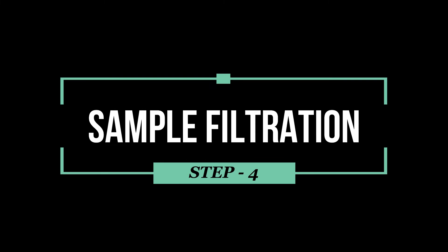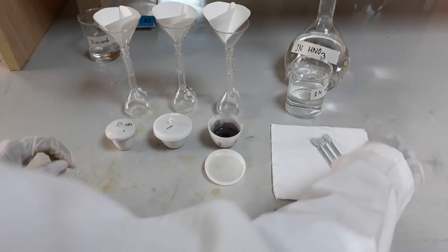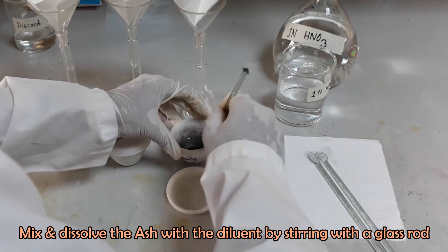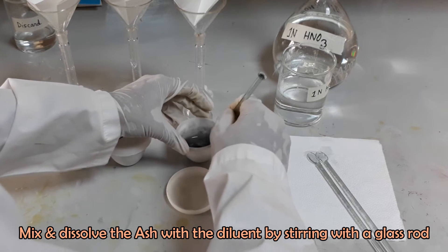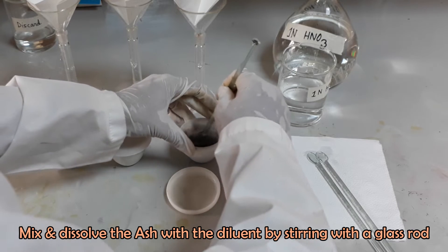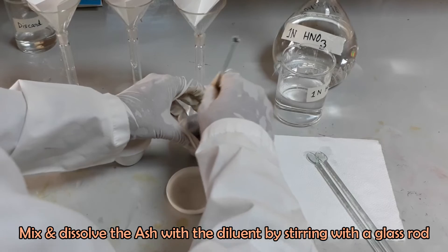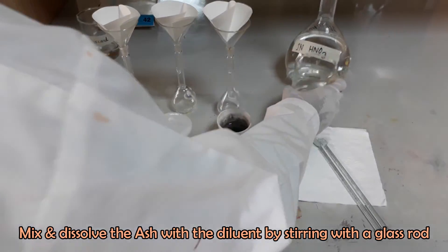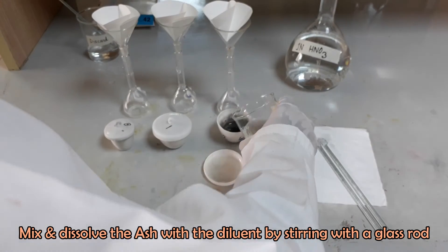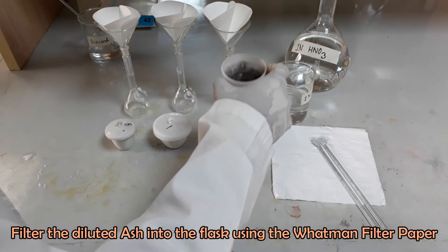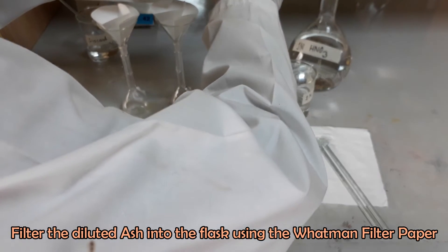Now we will filter our samples and blank. Mix and dissolve the ash with the diluent by stirring with a glass rod. Filter the diluted ash into the flask using the Whatman filter paper.